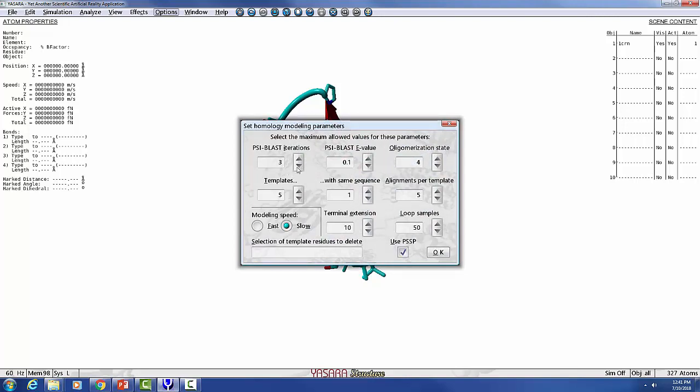In this field, the default is pretty much what you want for a high quality image or three-dimensional representation. If you want a quick analysis, you could just bring these numbers down to 1, and so it'll be fast, but it may not be accurate.